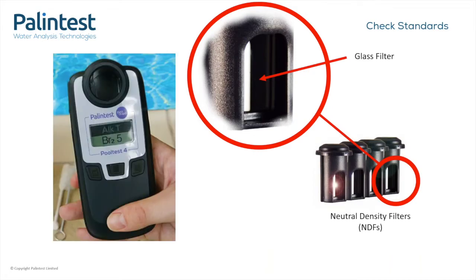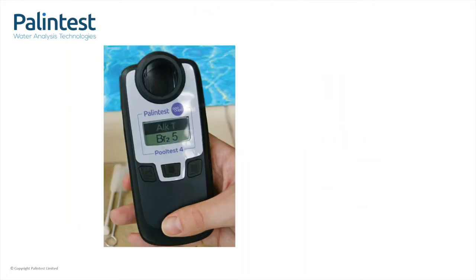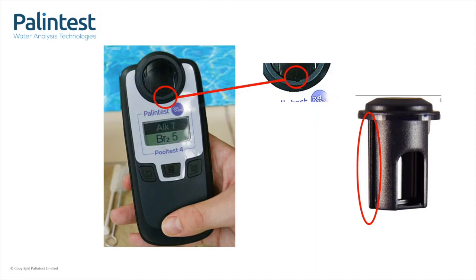NDF standards are what we supply for use with our compact photometers. Because they are flat glass, NDFs have to be positioned at exactly 90 degrees to the light beam. So, this notch in the cell holder ensures that the standards are always located correctly.